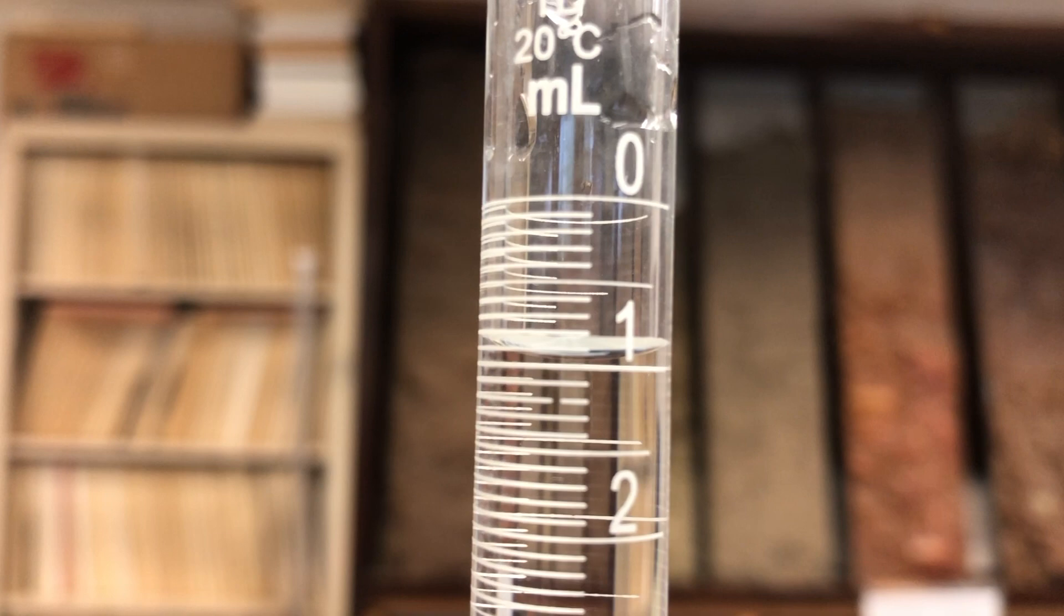Before beginning the procedure, remember that a burette reads backwards with 0 at the top and 50 milliliters at the bottom. It is important to record both the initial and final readings to accurately quantify how many milliliters were dispensed.